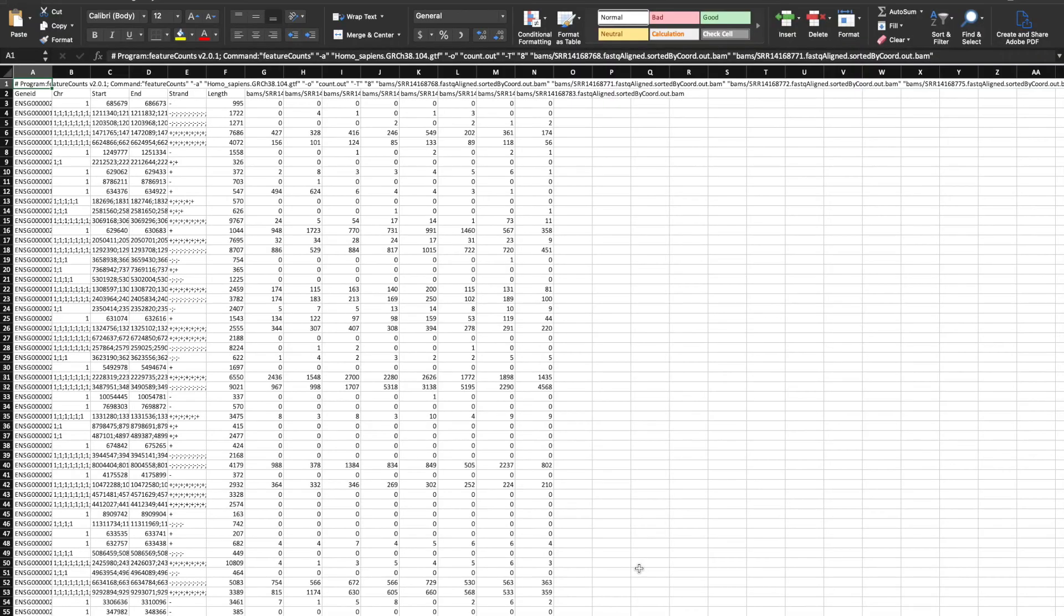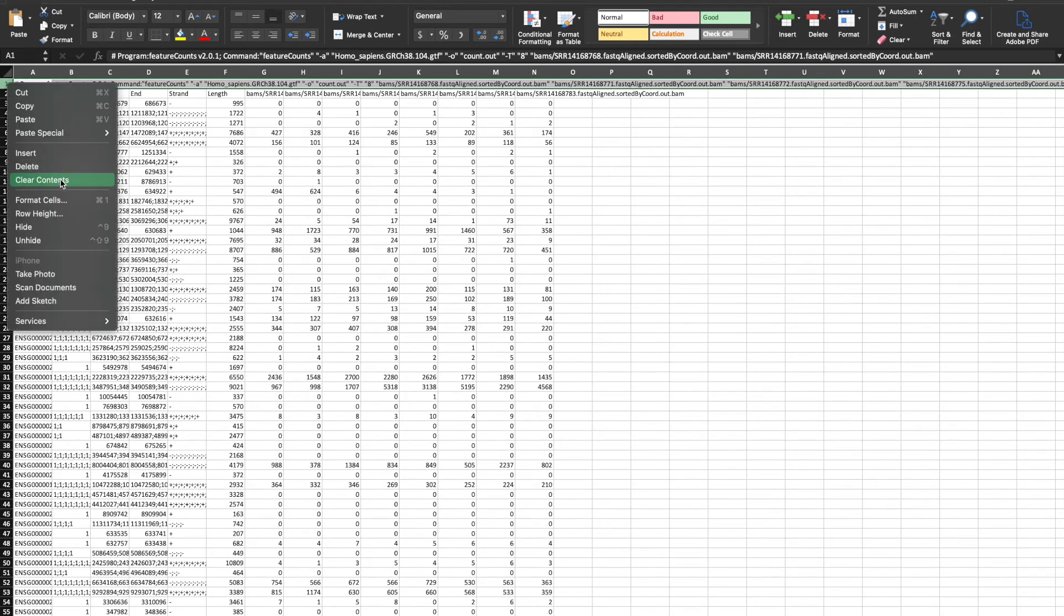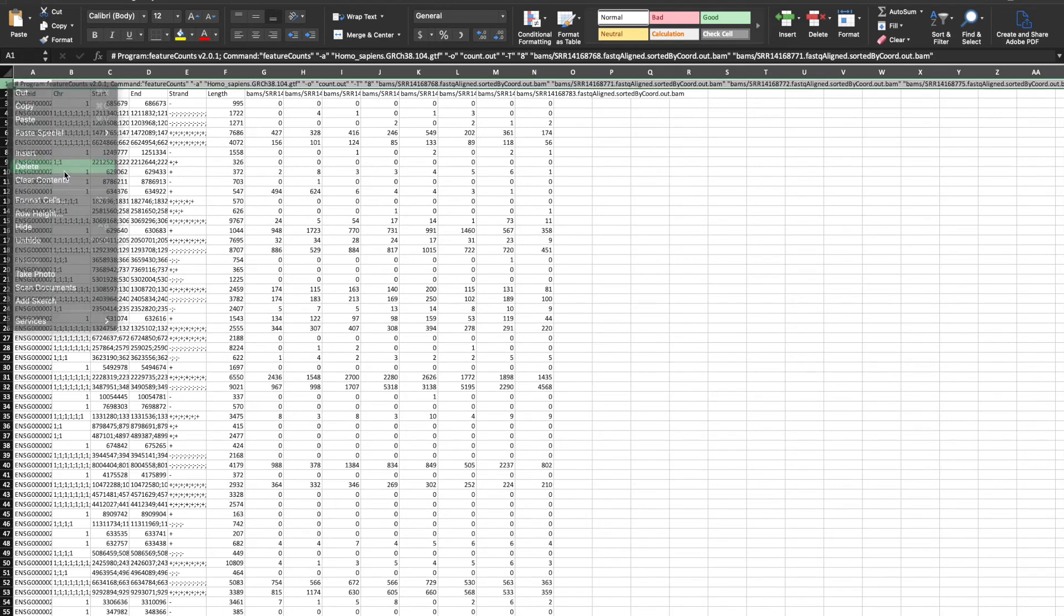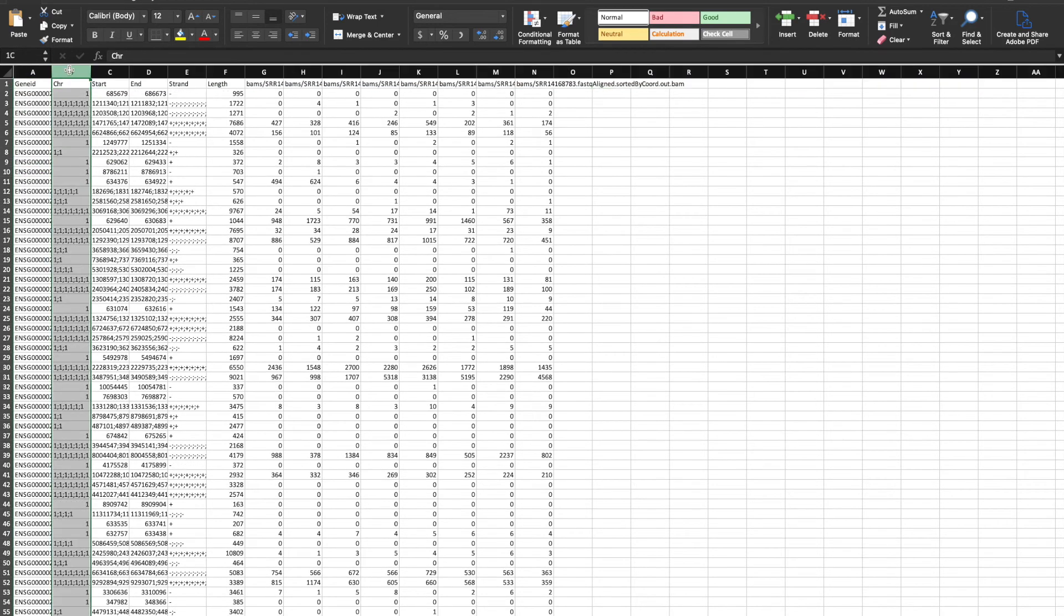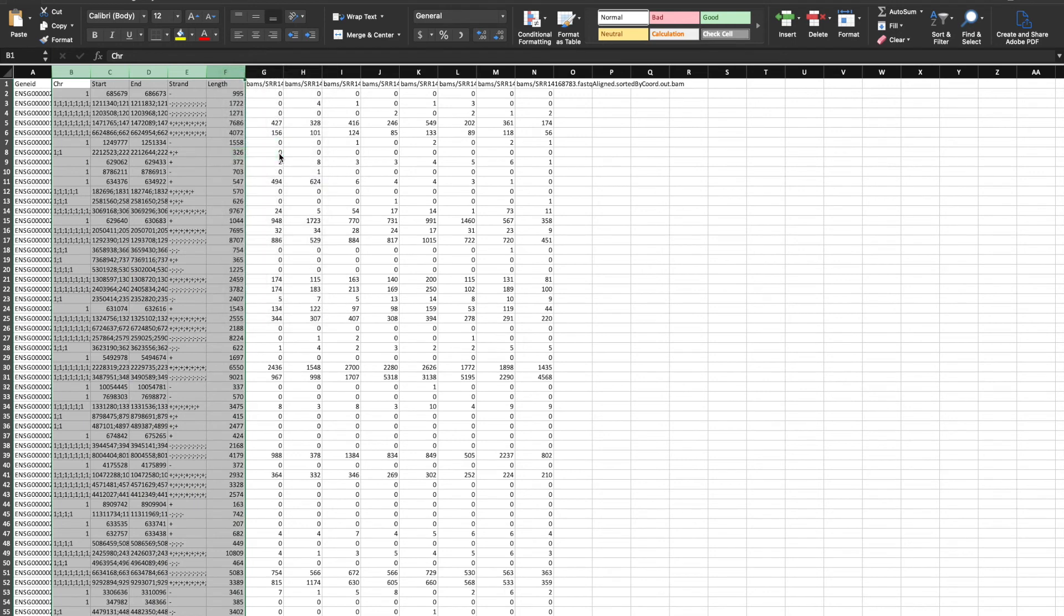So here I've gone and opened it in Excel just to show what's going on. So for the simple differential expression analysis we're going to do, we don't need a lot of this. For example, we can get rid of this first row. We can get rid of all these columns.